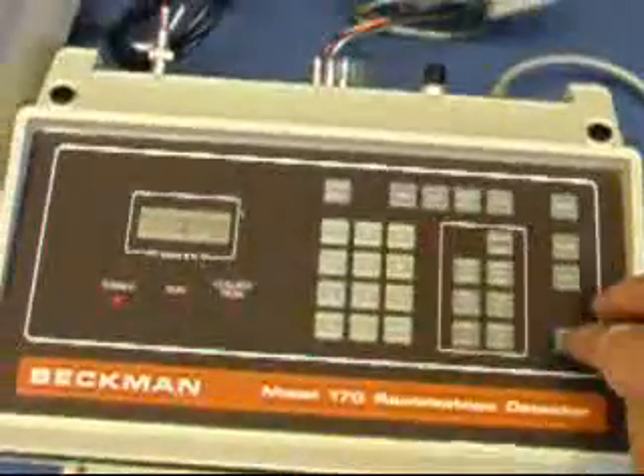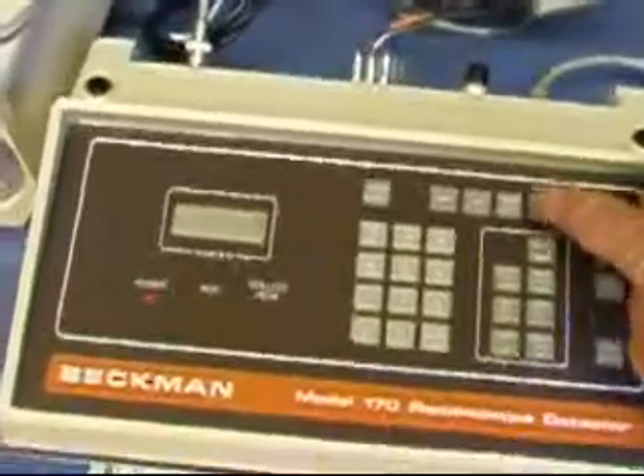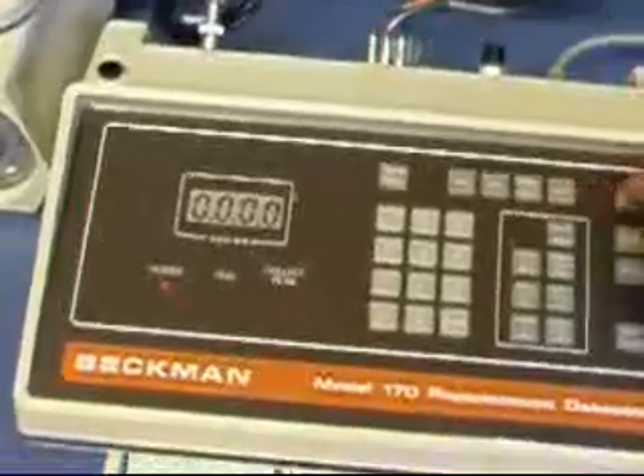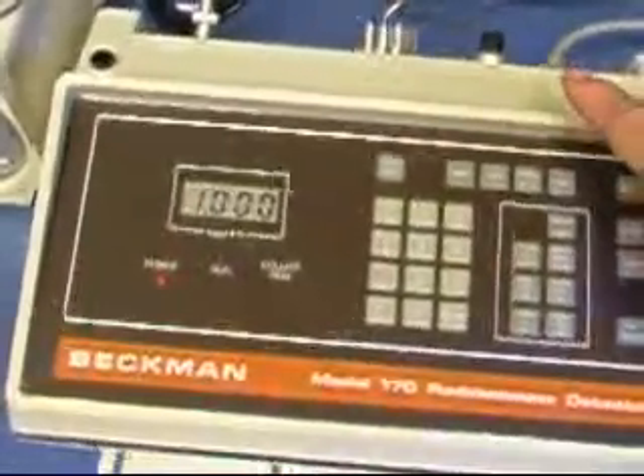And now when we try each of the buttons in turn. Here's the reset button. The diagnostic button. The normalization factor button.